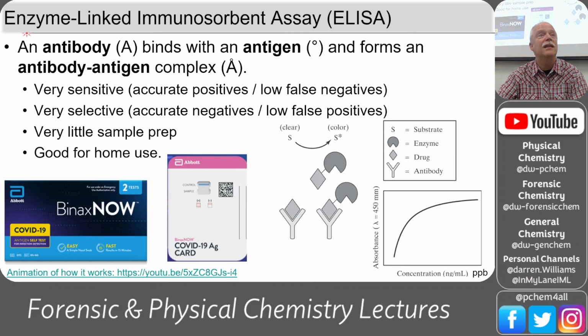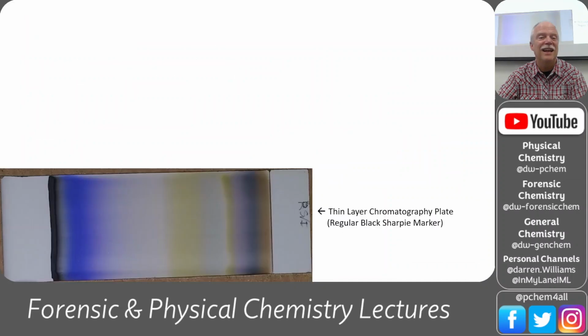And then we have, yes? So were you able to determine just using that if they were saying the same thing? They look completely different. Yeah, it's completely different. That was the conclusion, that they really are different. The industrial Sharpie just has a different pattern of compounds. So it really is a different formulation.